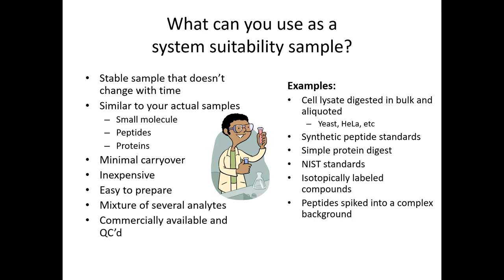And so the system suitability concept for me really hit home when we did these cross-lab studies where we had no idea. We gave people protocols and sample kits and said, run them. And we didn't specify the last time somebody calibrated their instrument. With triples, you don't need to calibrate that often, but it should be within 6 months maybe. And we didn't know the age of electron multipliers and all these things. And so when we started getting data back, we're like, oh, this site is not doing so well, but everything seems to be okay. So we established the system suitability protocol, and then we were able to see variability between the sites for the same exact sample, same exact method, same exact everything. And we knew that, all right, the variability is now due to the instruments and not sample handling or anything else.